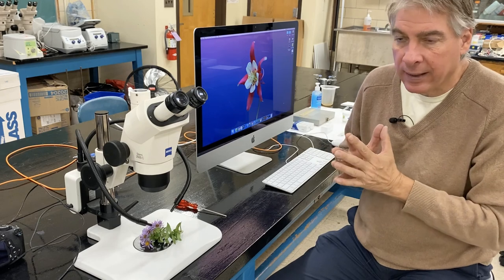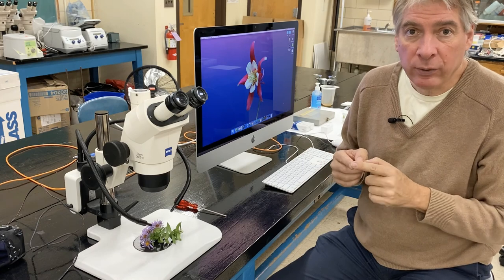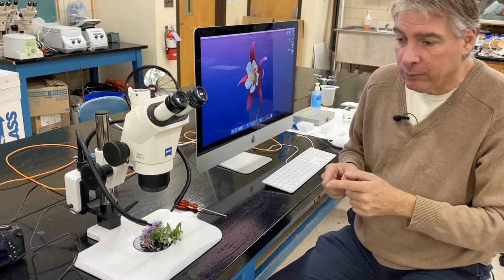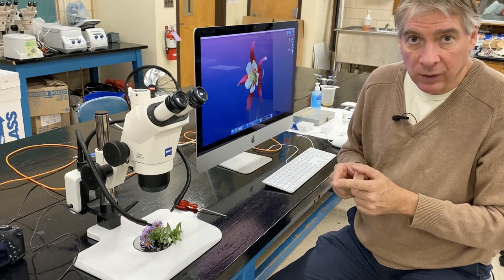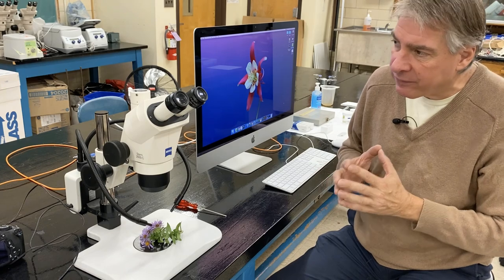The stereo vision allows you to have depth of field. So when you're doing something like a dissection, you can tell that one hand is higher than the other, or that the scalpel is at the level of the tissue. You don't have stereo vision in a compound microscope because you're looking with both eyes through a single microscope objective — the light enters and is split, some going to your right eye and some to your left eye.